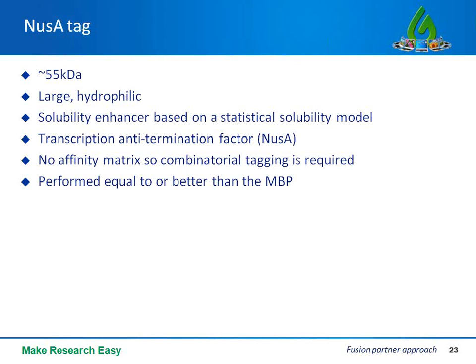Now NusA does not double up as an affinity tag, so NusA fusion proteins are typically used in conjunction with another affinity tag, usually the his tag.